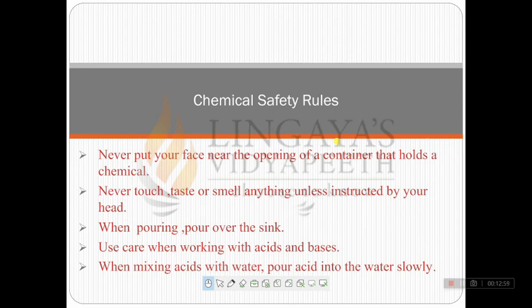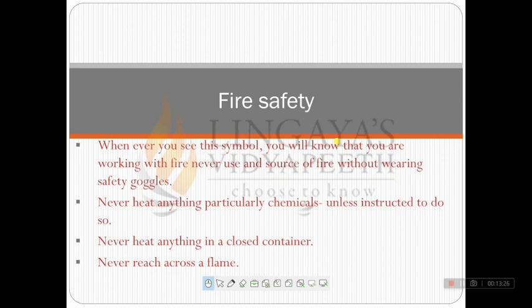Use care while working with acids and bases. So you have to be very careful while you are working with acids and bases in the laboratory. When mixing acids with water, pour acid into the water slowly. When you are mixing the acid with the water, you have to pour the acid slowly into the water. It should never be done that water is added to the acid. Always pour the acid into water, and that too very slowly.